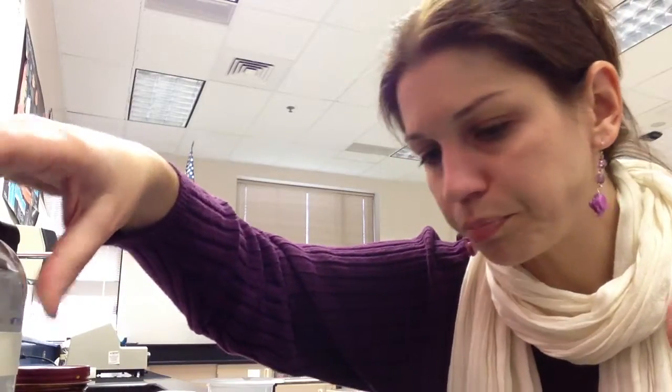If for some reason you go over there and there's not any 1.5%, you can dilute it down yourself. It's not hard because you're going to be getting 40 mils of each one, so to cut this 3% down to 1.5%, just get 20 mils of this, and then add water to bring it up to a volume of 40 mils, and you're good to go. Or you can tell me, and I'll make some, but usually that involves you waiting around for a little while, and that sometimes can be a bummer.